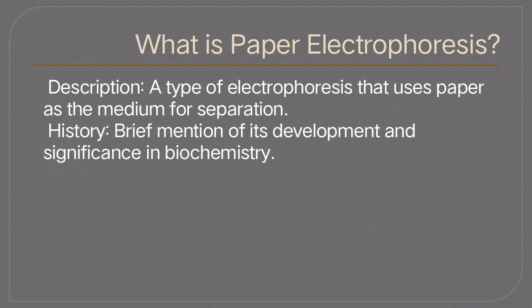What is paper electrophoresis? Description: a type of electrophoresis that uses paper as the medium for separation. History of paper electrophoresis: a brief mention of its development and significance in biochemistry.